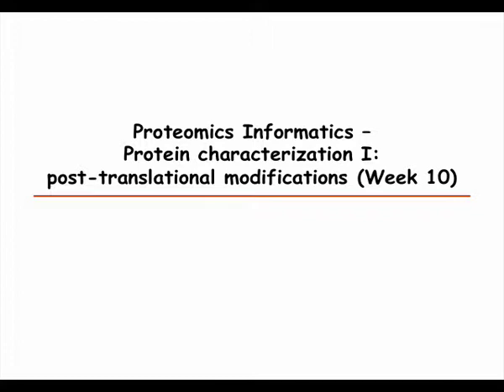These modifications often modify the function of the protein or are used for some kind of signaling or change of function. So that's why we set out to try to analyze as many of these modifications as possible, either by focusing on a single protein and trying to characterize different modifications when it's in different states, or we look at it globally on the whole proteome.